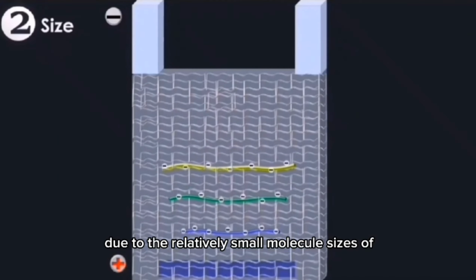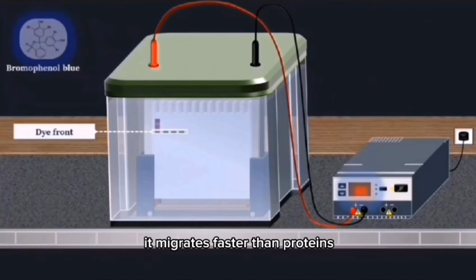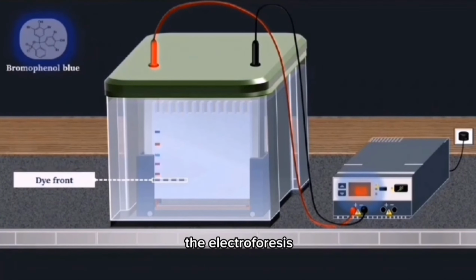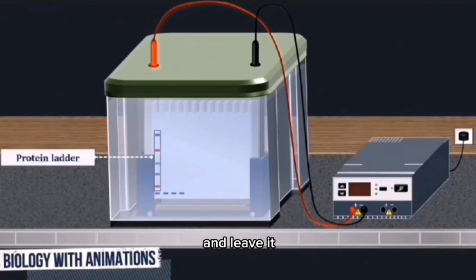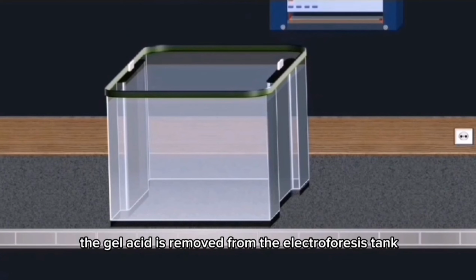Due to the relatively small molecular size of bromophenol blue, it migrates faster than proteins, and by optical control of the migrating colored bands, the electrophoresis can be stopped before the samples have completely migrated through the gel and leave it. Once the proteins are separated, the gel cassette is removed from the electrophoresis tank.